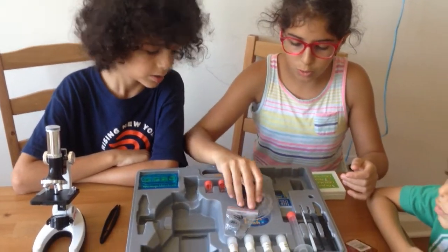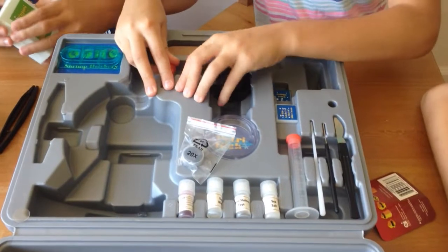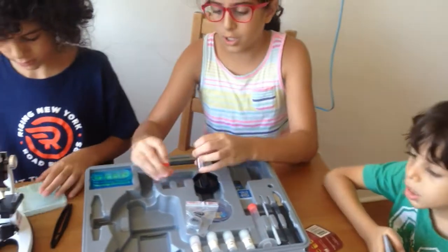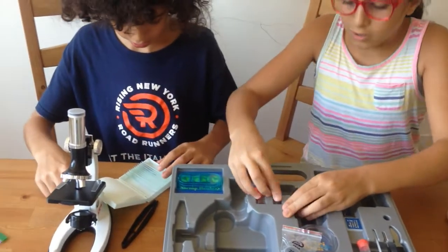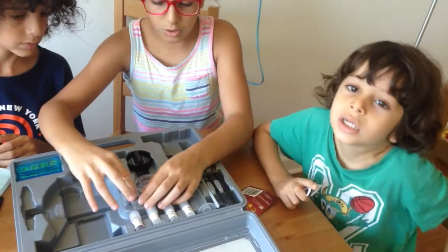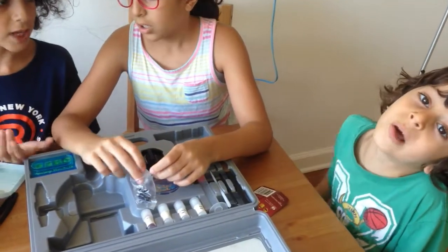To put your sample — now we're just going to put the ladybug in the bag. It also comes with two containers. Ladybug success! We saw a ladybug and we just found one, then we just found another one.